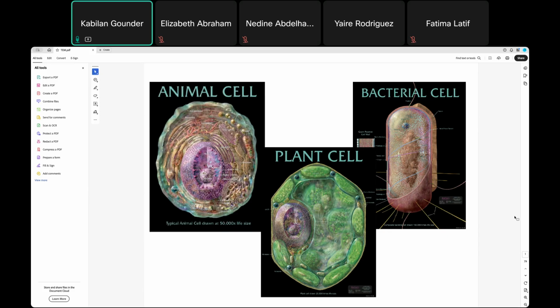Similarly, the transmission electron microscope is like a typical light microscope, when you go for cross sections or transverse sections, and the light source penetrates your sample so that you see the structure of the cells.